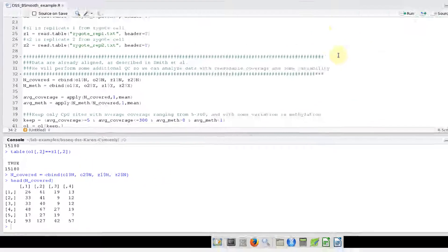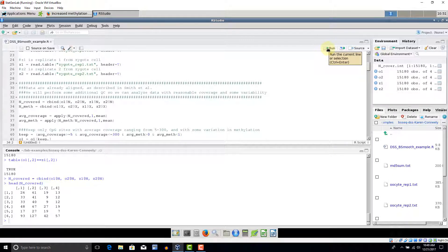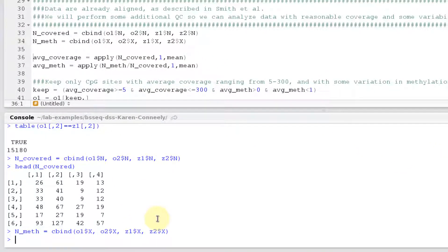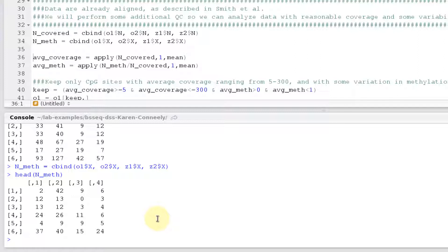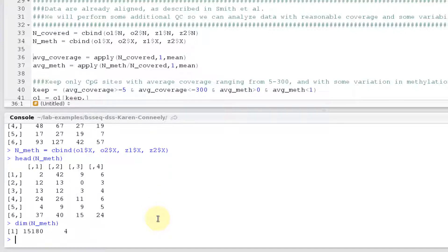We can run the same command for the methylated read counts — this was the column named x. The numbers in this matrix are smaller because these are only the methylated counts; unmethylated counts are not included. We can also check the dimension — it should have the same number of rows as the original data, 15,180 — and it does. We've now created these two matrices that we'll use to compute average coverage and average methylation proportion.